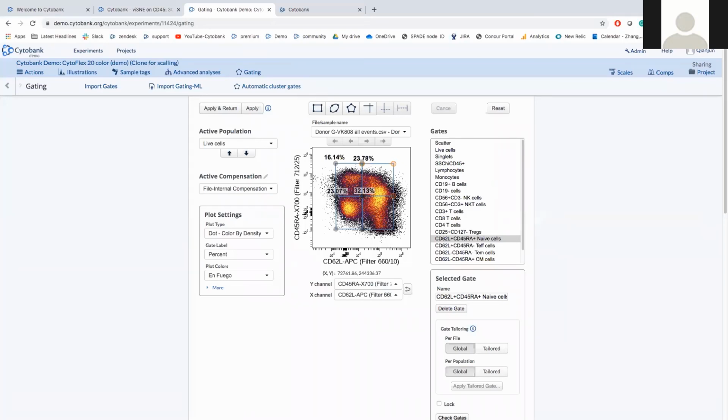So we do also have a few questions with regard to the job feature and how to analyze seq data. So actually we will have bootcamp session number 6, especially focused on that question. So please stay tuned for our next one. Our colleague Chi Hao will talk about that in much more detail later.